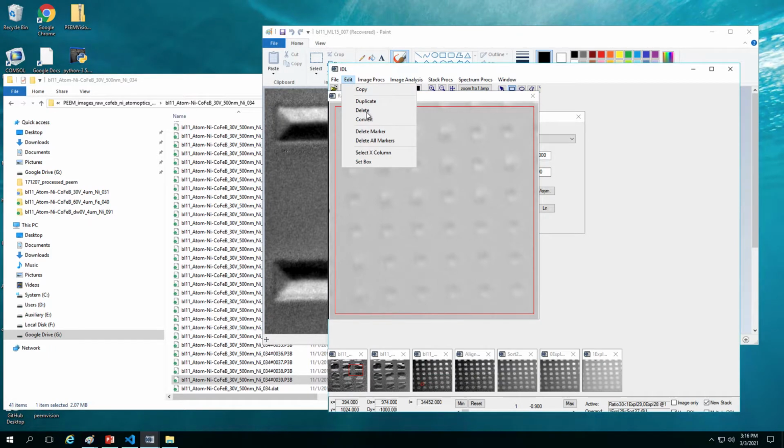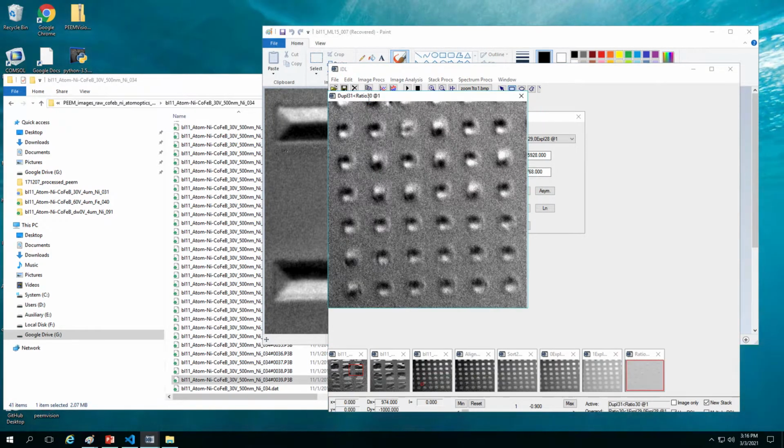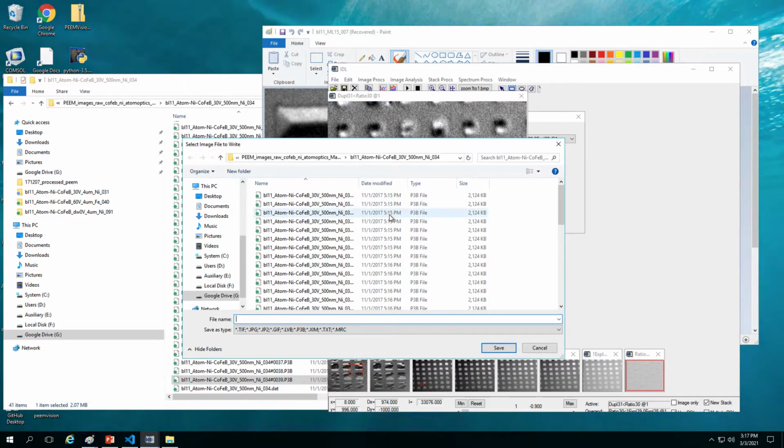And now we go to edit and duplicate. Yep, so here is a better version of the high resolution images. Somehow I see this kind of structures look like they are a little bit shifted, so you have this kind of 3D artifact. So I think you could try again to see whether this is really the artifact due to alignment, right? Or it's because just how the sample looks like. For now you can save it, and if it gets better you override it. Okay.